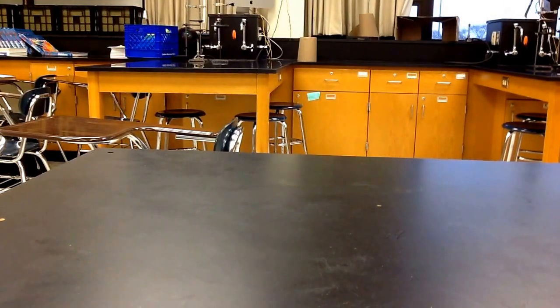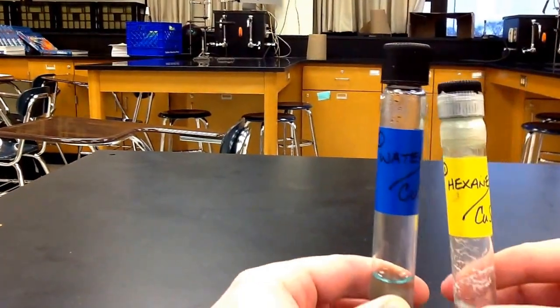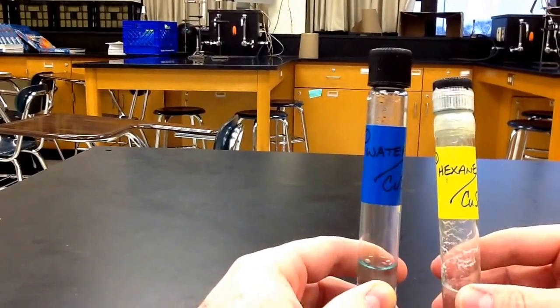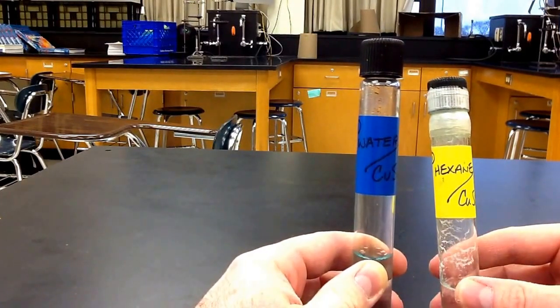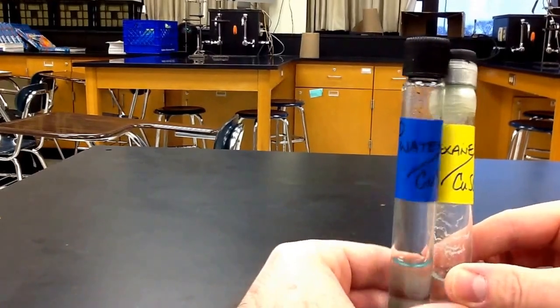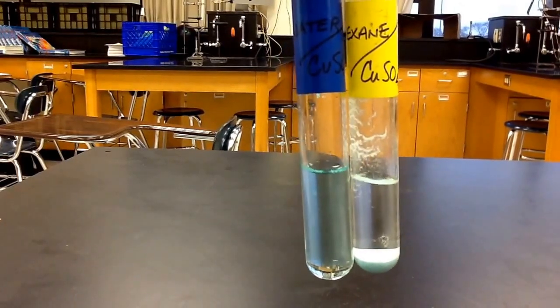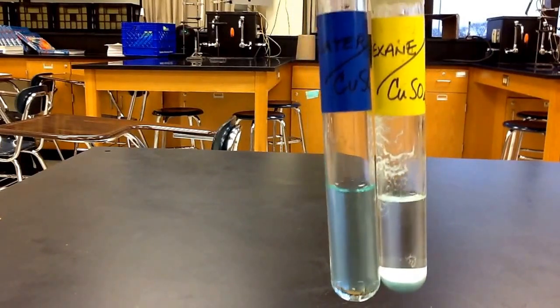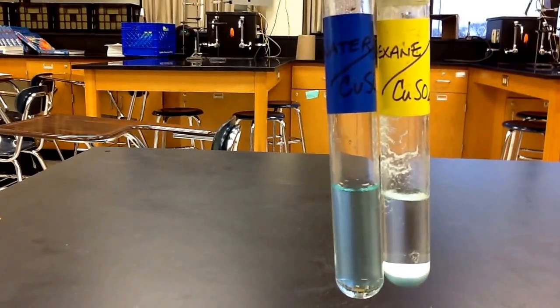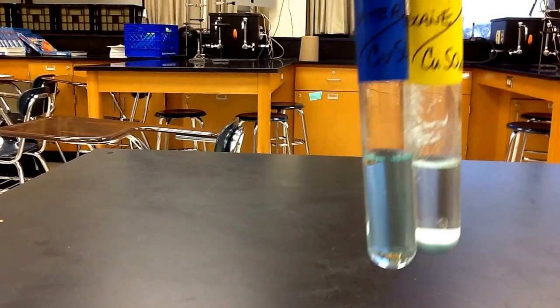The blue label is going to be water, and we have hexane. So the solvent is water for the blue label, and for hexane it is going to be the yellow label. As we can see here, we've got copper sulfate, and copper sulfate is going to be soluble, S, in water, and in hexane it is insoluble. No matter how much we shook this or stirred it, the hexane would not dissolve the copper sulfate. So that's our first one, copper sulfate.